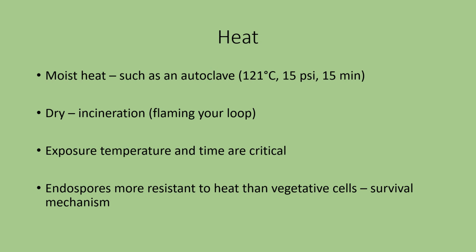If it's a heat sensitive thing, you're going to have to find another way to sterilize it, to inhibit or destroy growth on it. Dry heat, an example of this is incineration, where you burn things. That's what you're doing every time you flame your loop. The temperature and the time, as I said, are critical.